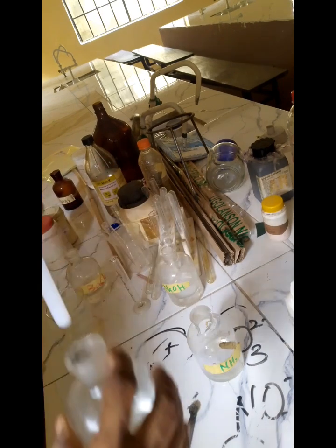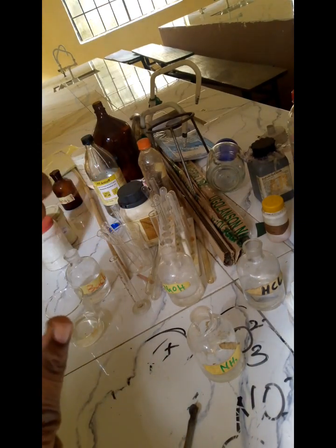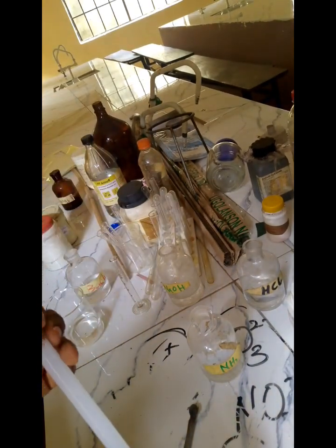Oh, look at it. In essence, this is a clear solution now. The precipitate has dissolved. Look at it, it has dissolved. I hope you can see. The precipitate is soluble in HCl. The precipitate will dissolve.